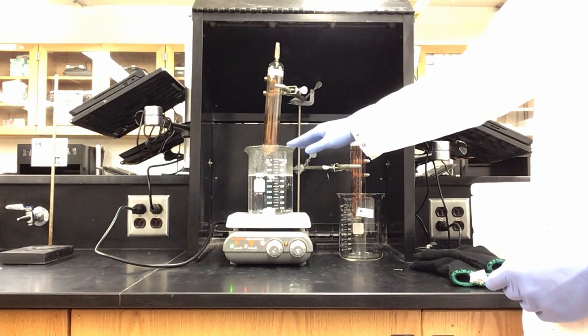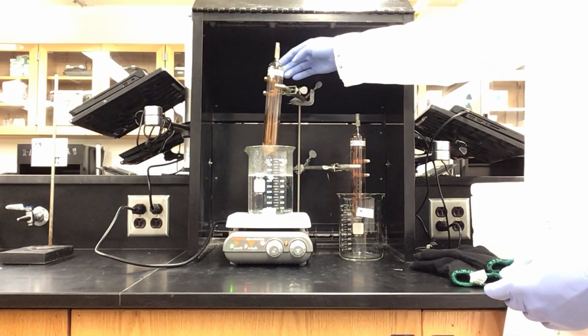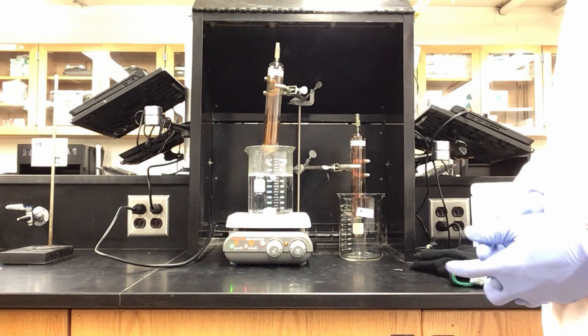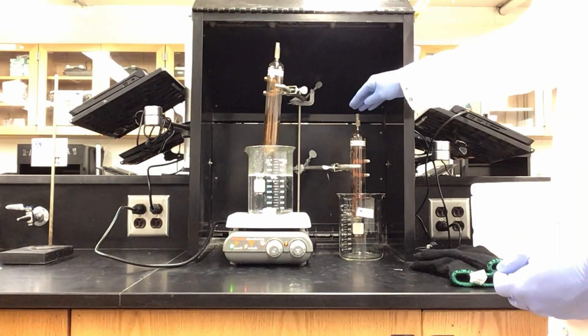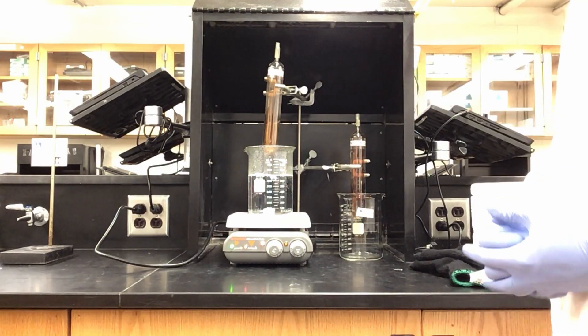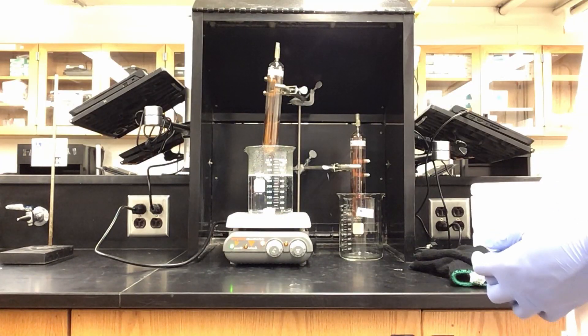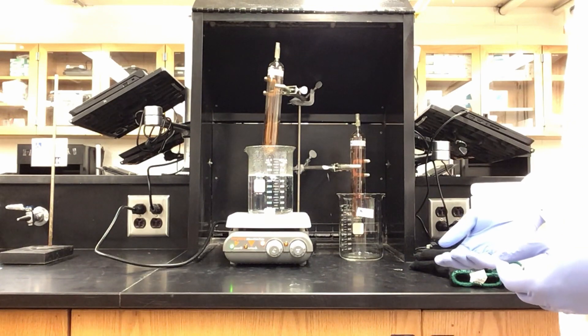The hot water bath will cause the gas, which is currently brown, to favor the NO2 gas side of equilibrium — it should then become darker. When I place this tube into dry ice, it will favor the N2O4 side of the equilibrium, and we should see the gas, which is currently brown as well, start to become lighter.